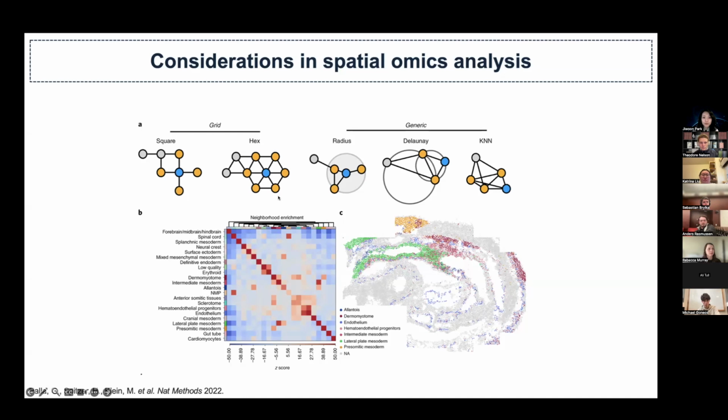But not only do we organize the cells in a grid for easy XY coordinate calling, we can also define the locations and neighborhoods of the cells by taking a cell and a radius and defining a neighborhood.